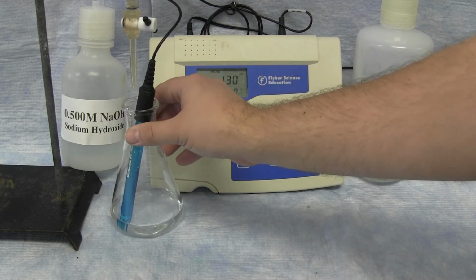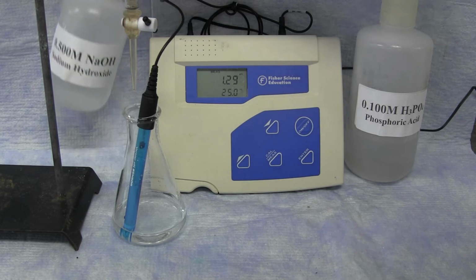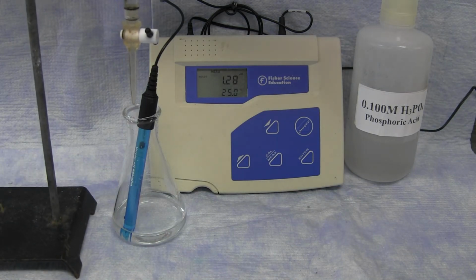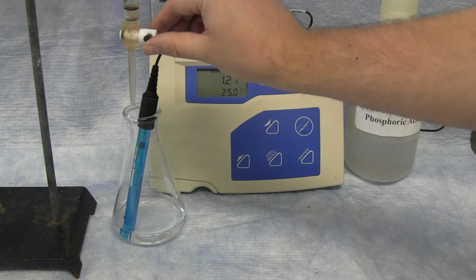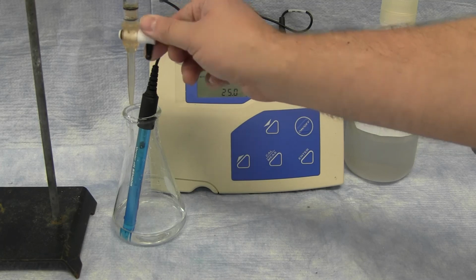In this case, the pH is 1.30 or 1.29. You can then begin to add the sodium hydroxide from the burette. You're going to add exactly 1 milliliter of the sodium hydroxide.